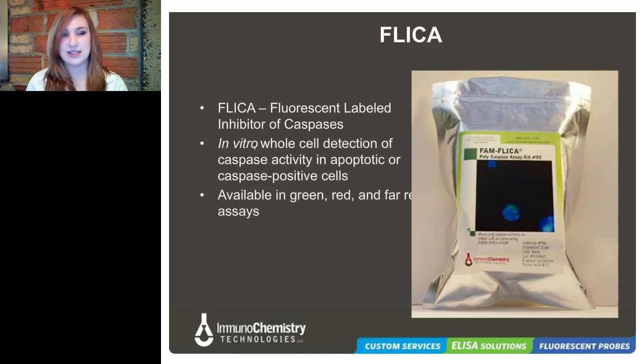So as you're assessing your particular experiment and looking to determine what the number of tests are, we do define a test as a 300 microliter aliquot of cells that are grown at no more than 1 × 10⁶ cells per milliliter. So just something to keep in mind as you're thinking about your own experiments as we go through some of these assays today.